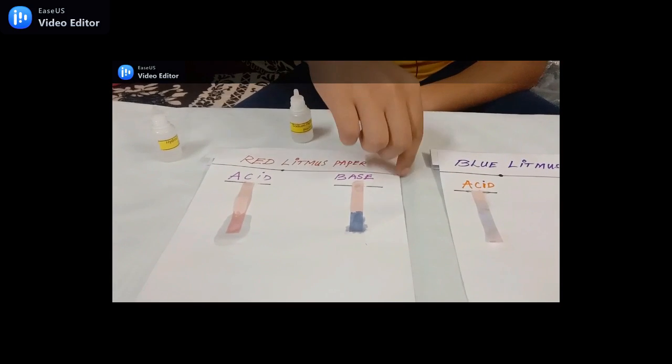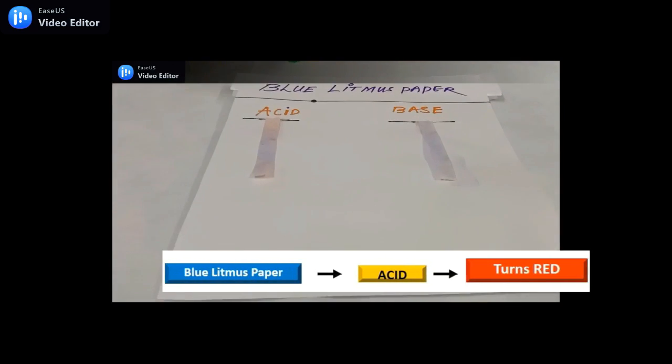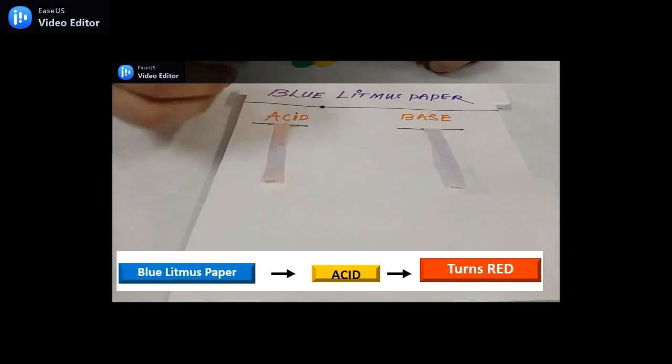Now let's put base on red litmus paper. It changes its color to blue. Now let's repeat the same process on blue litmus paper.